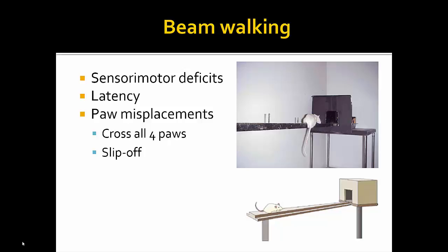If you have animals that drink, you do alcohol studies, so they drink more at night. So to see them drinking during the day, you probably put them on a reversal dark light cycle, so they're dark during the day and light at night. That could be something that you would have to do. The only thing is, we run this in the dark except for that bright light. So they are in the dark, except for the bright offensive light that they're supposed to run away from.